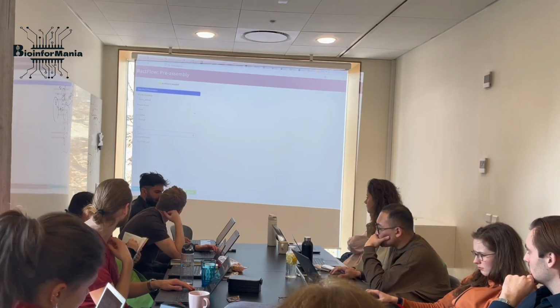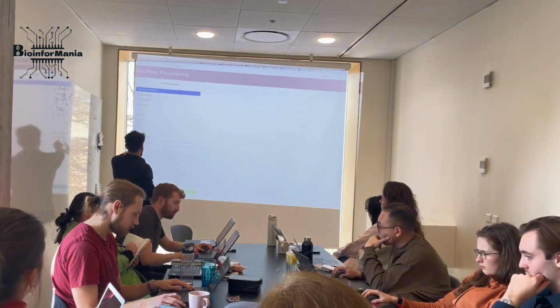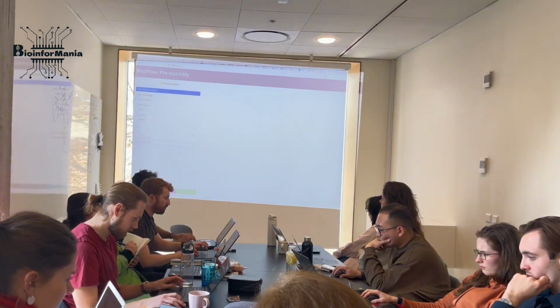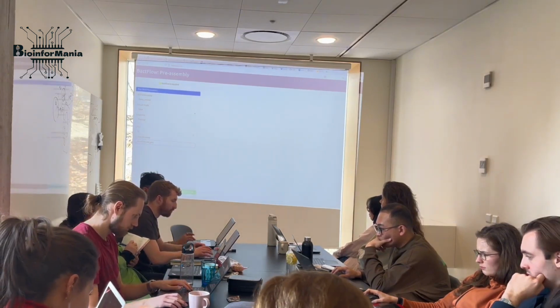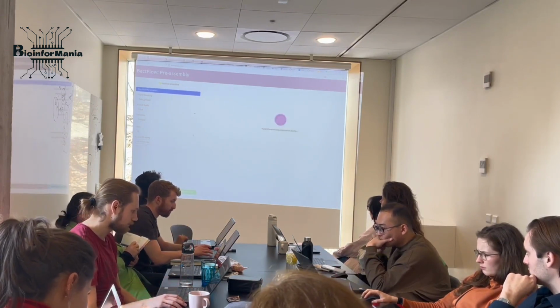I give it 12 because mine has access to it. I want to create a directory called BactFlow out underscore, I'm going to give it a unique name, underscore pre, which means this is for the pre-assembly part, okay? Or let's just call it out for back out. That's it. And then you initiate the reads.